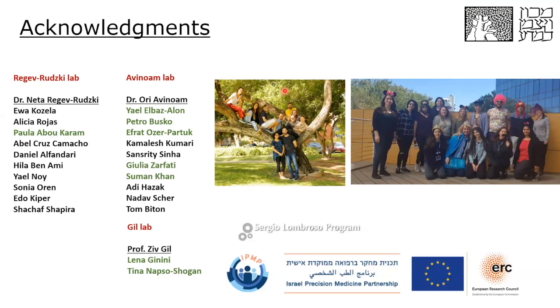Okay, that's perfect. And Ami has another question. Yes, thank you for your presentation. It's an impressive presentation. My question is regarding your cryo-EM images, and I want to know more about the resolution and the size of your images, and also the methods that you use to reduce the noise, because normally we don't have these shapes from cryo-EM, and you compare in one part the intensity of the pixels with the other. So I'm wondering what method you use to obtain this kind of images.